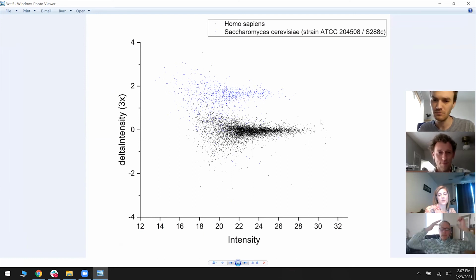And you can see at lower intensities, there's more noise. That's just a signal to noise thing. At higher signal, there's less relative noise, and at lower signal, there's more relative noise. So I think it's kind of a nice way to visualize this.